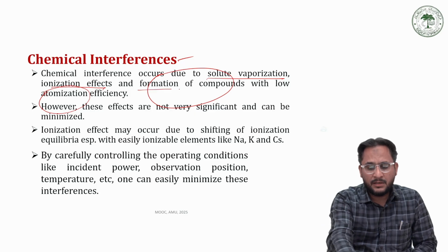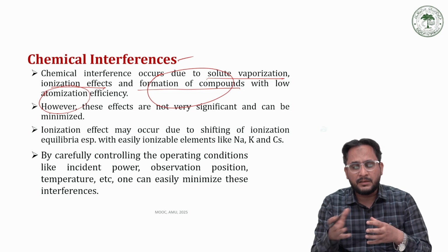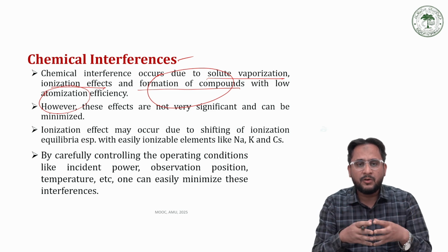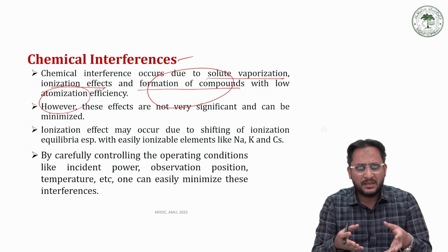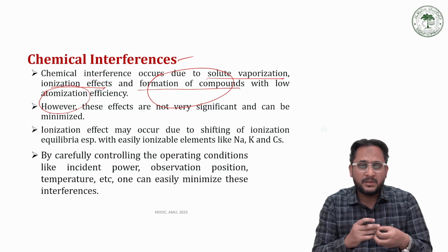This happens when atoms recombine back to form the molecule, or when we have samples with very high thermal stability. Although with ICP this can be minimized.